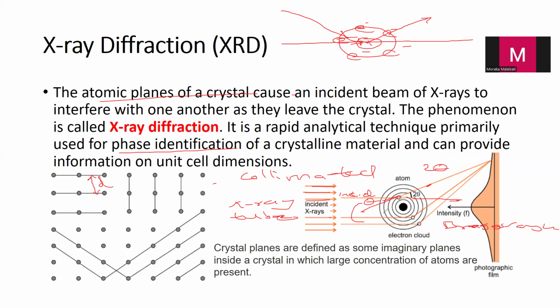You must understand now that these diffractions would interfere. When these diffracted rays interfere and are in alignment, they cause what we call constructive interference, and this constructive interference will be detected by what we call a detector.